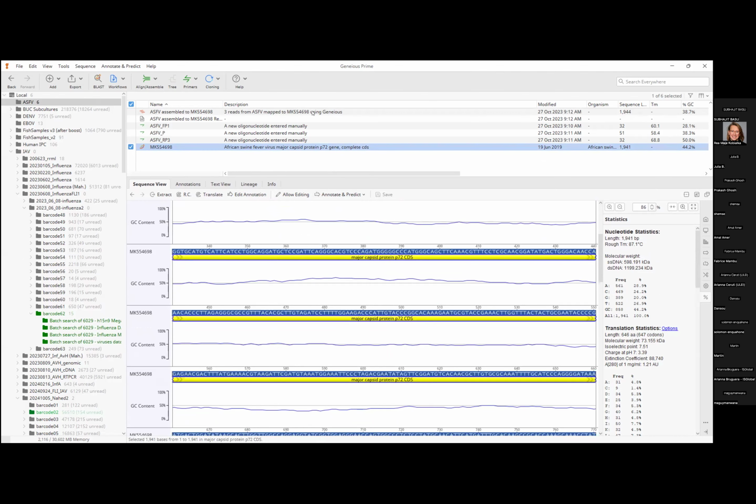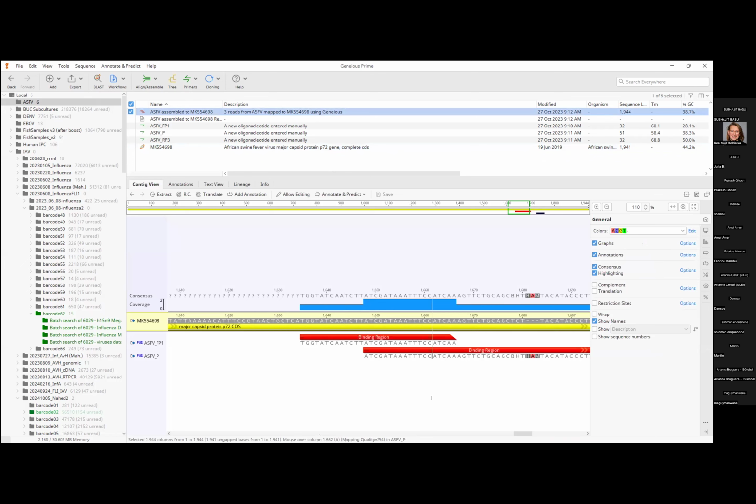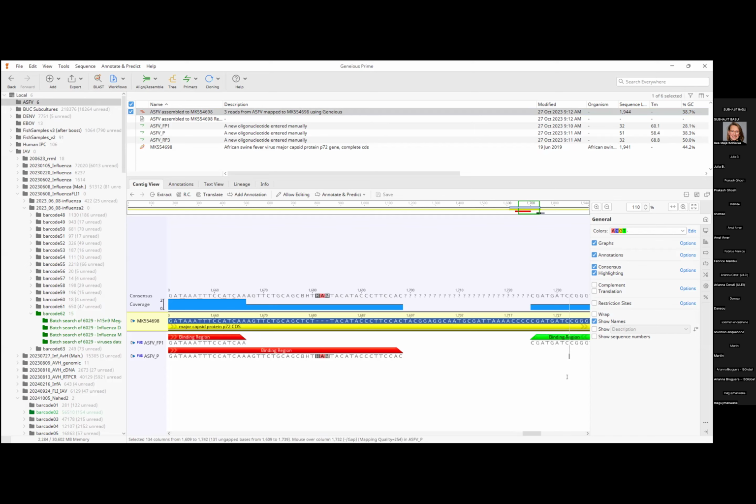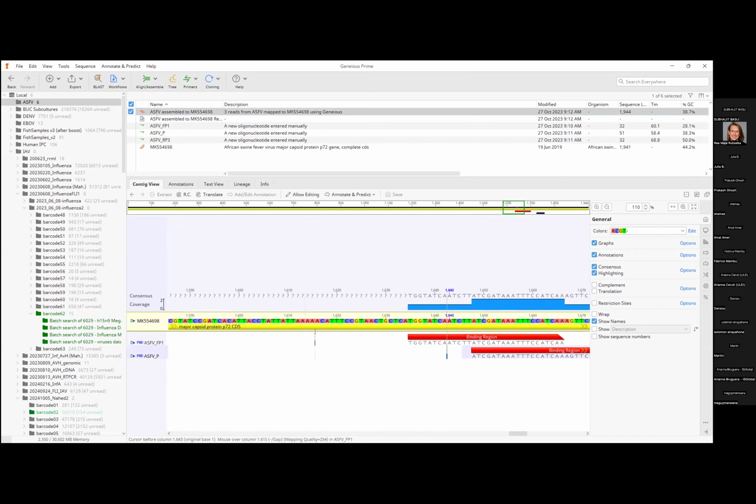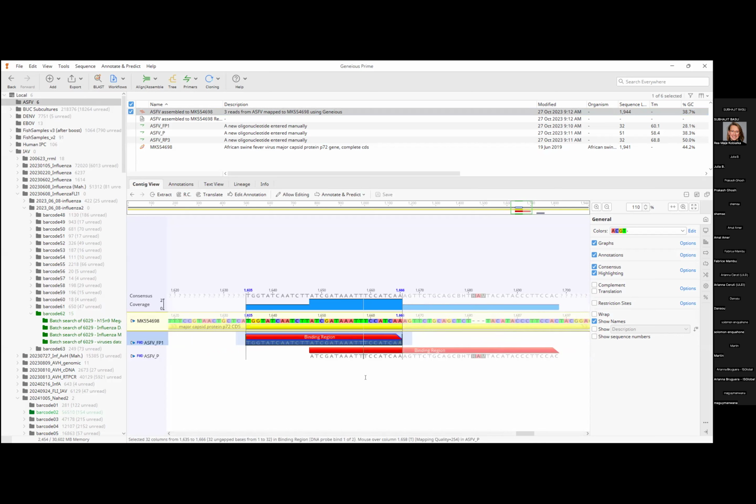And what I wanted to do in this case is design primers for an assay, for a molecular test assay. I just went into the whole sequence. You can see it here. It tells you how many base pairs you have, how many gaps, how is the annotation. And in this case, I just chose a region that fits my primer characteristics that I want to work on.